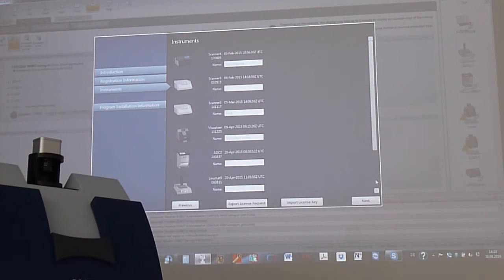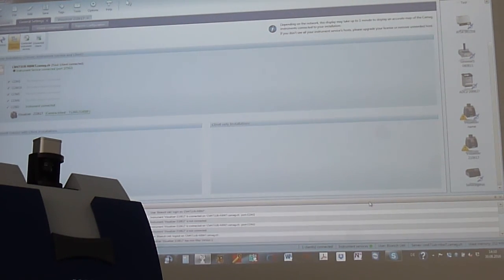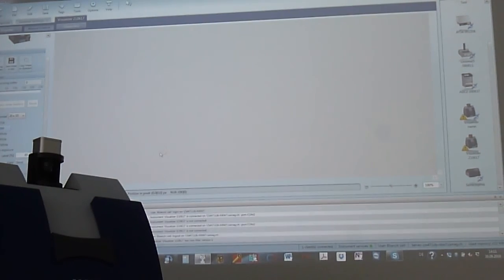I think we should keep WinCat more time, maybe until we finish developing Vision Cat. He's going to kill you. And I think the IT equipment also. If you also update the driver for the connection for the FireWire, maybe I have to.